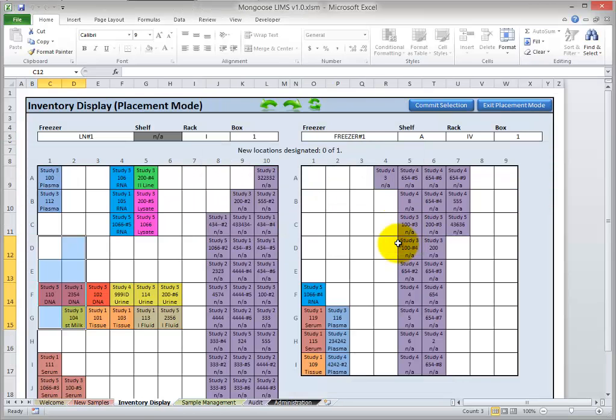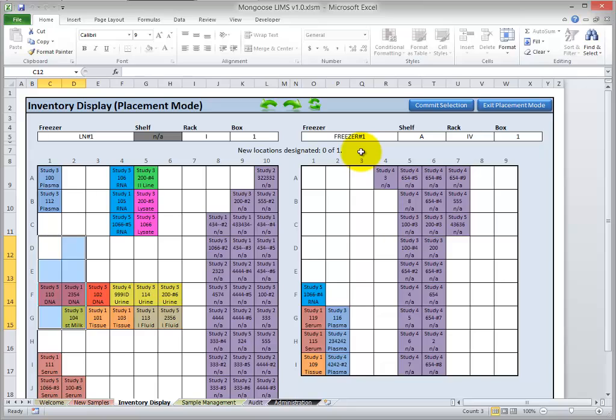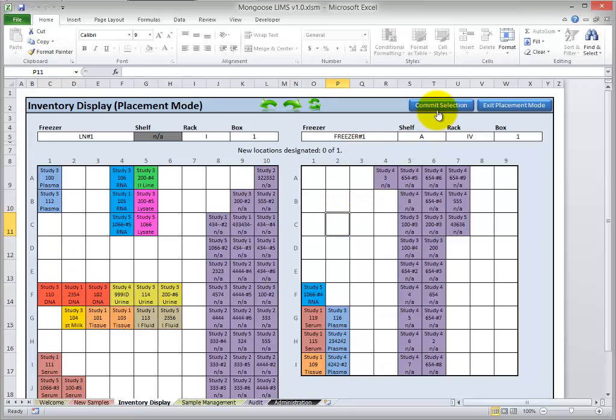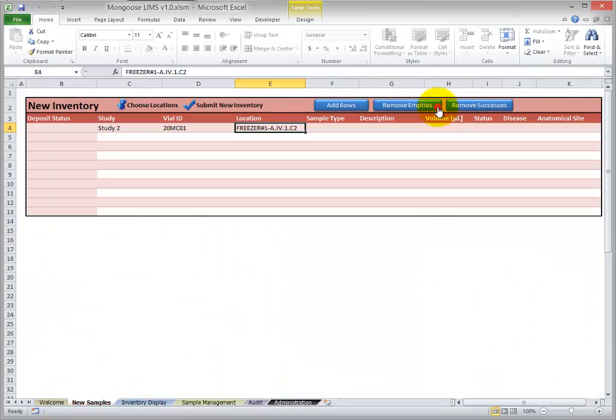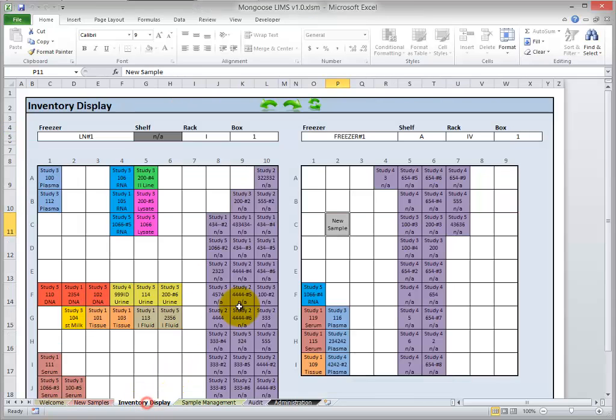So here we are back at the Inventory Display. Notice we're in Placement mode, and it says New Locations Designated 0 of 1. So I'm going to select where I'd like the new sample to be and click Commit. So you can see it places the location information automatically for you. And let's check back at the Inventory Display. It says you're going to have a new sample here.